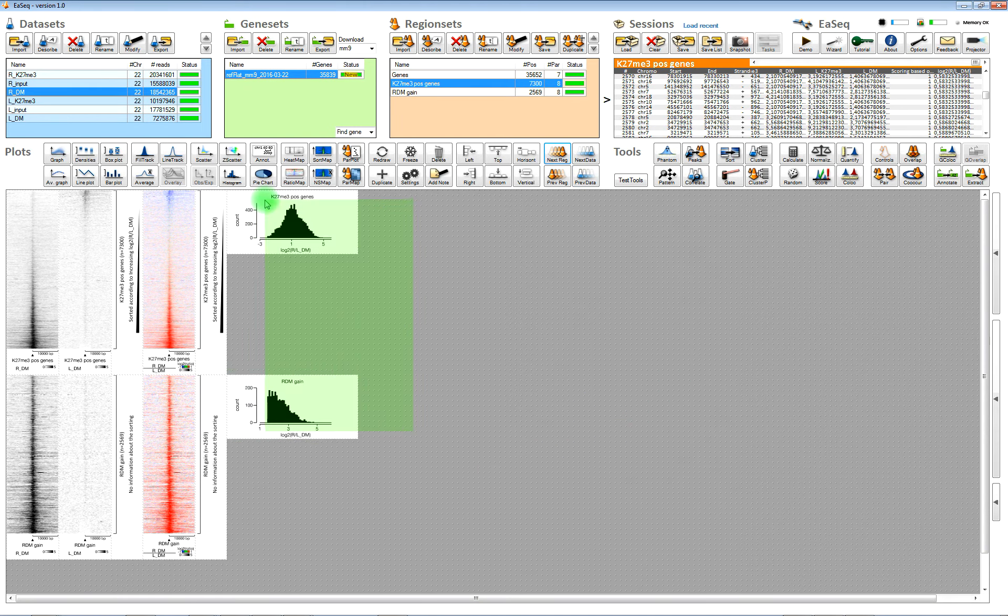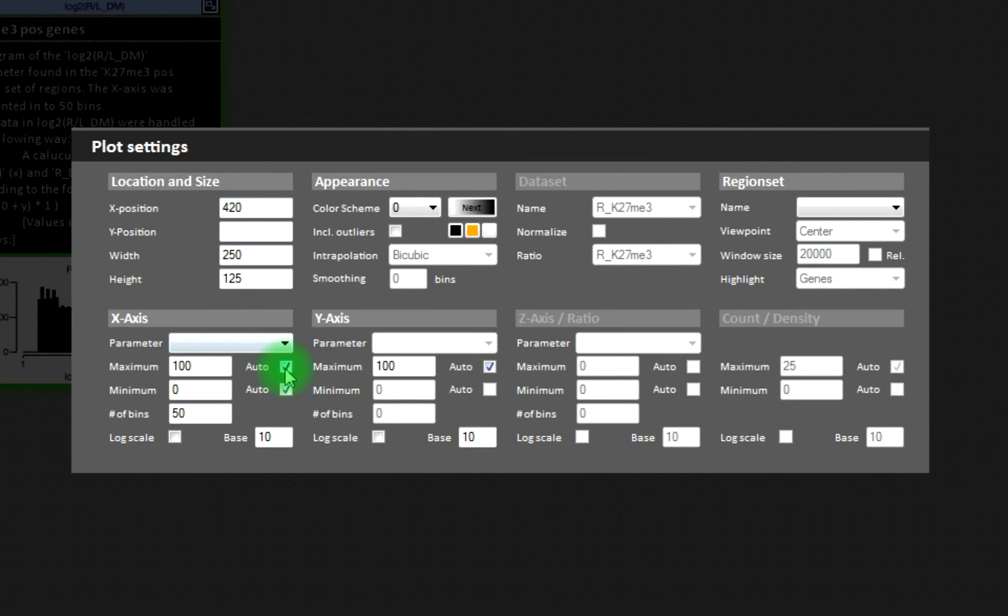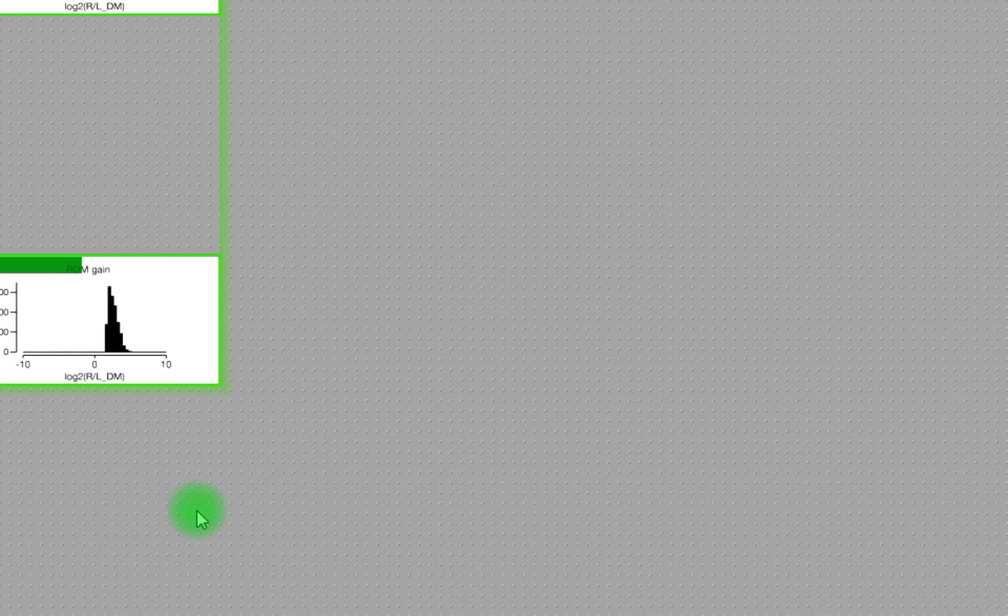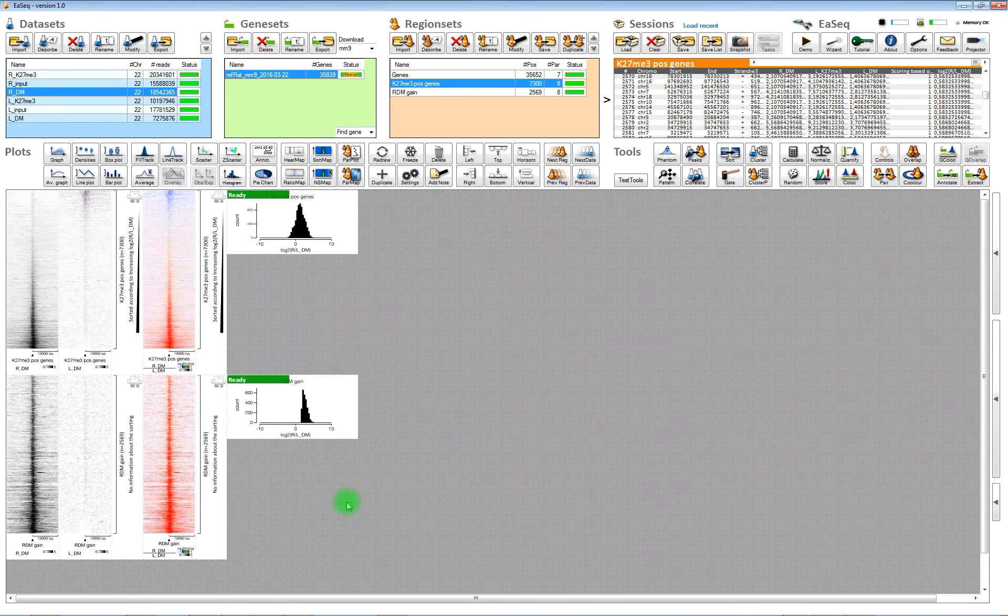We will also need to change the x-axis here so it fits more with the window we'd like to see the values in.